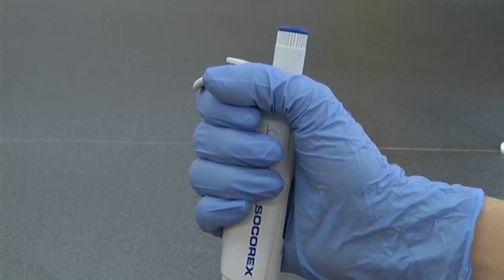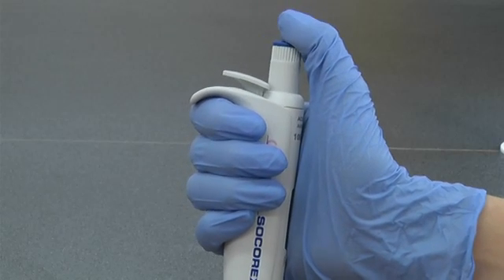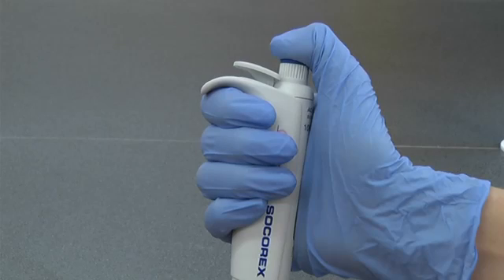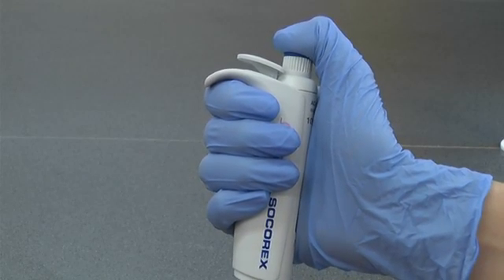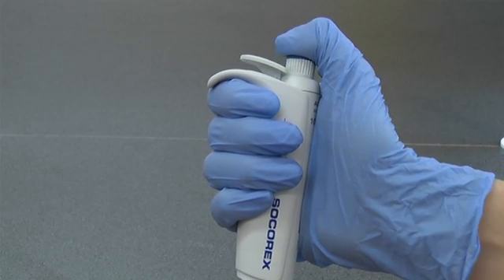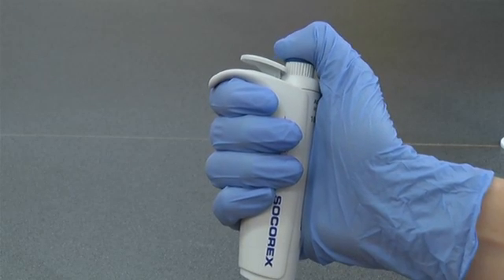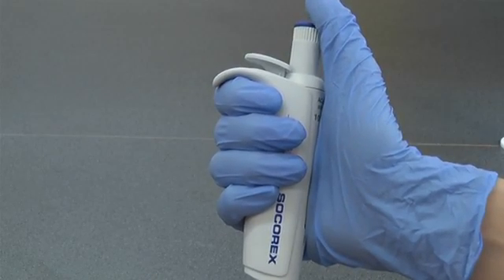The pipette can be held in your preferred hand, with the guard on your index finger and your thumb on the plunger. When you push down on the plunger with your thumb, you should feel there is a natural point of resistance. This is called the first stop. You can push past this point and fully depress the plunger — this is called the second stop. The action of the plunger should feel smooth. If it grates or seems to be stuck, the pipette probably needs cleaning or servicing and you should report it to a technician or your demonstrator.